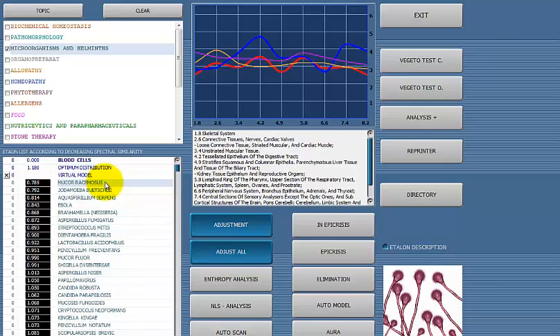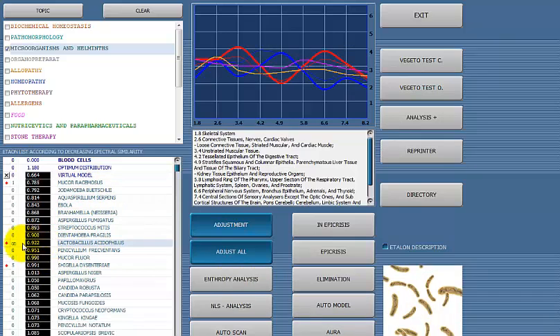Now, that was only one step. The next important step is called automodel. By clicking on this, you're basically prioritizing. You're asking the system to tell you which of these are going to be the most major problems. And you look for the infinity sign.